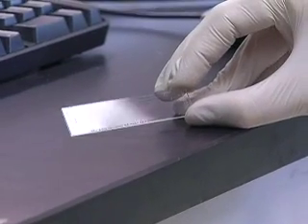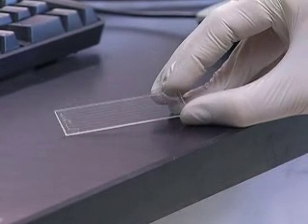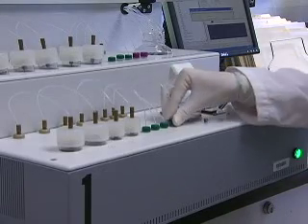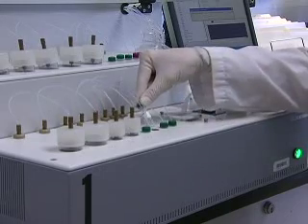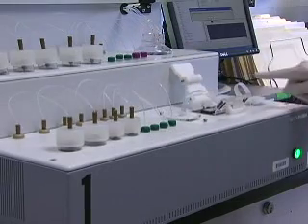A flow cell is like a slide with 8 sample lanes etched on it and a cover slip positioned on top that's attached to a collection of tubes. Small volumes of liquid can be pumped through the tubes so that the liquid completely covers the surface of the slide. The machine pumps different amounts of different liquids through the flow cell to automate steps of a reaction.